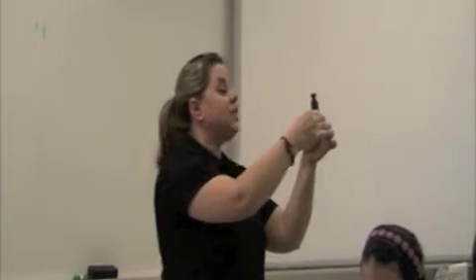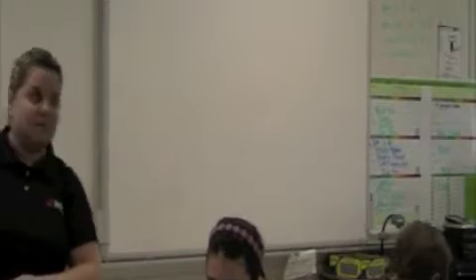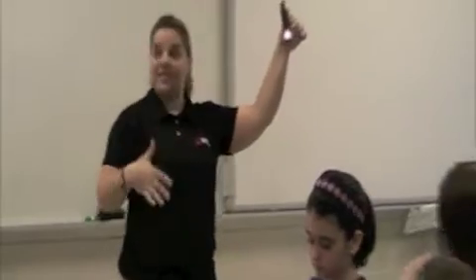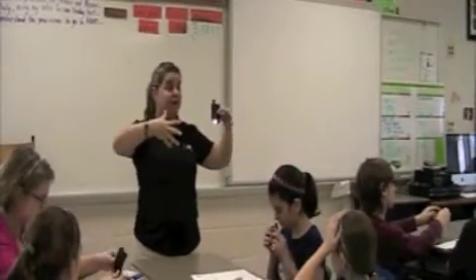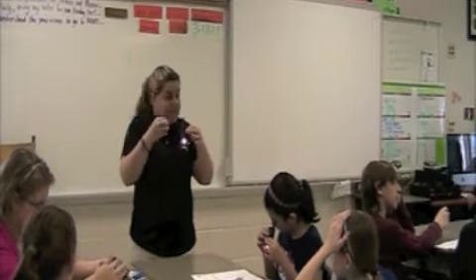Good job. Also, when I look through a lens, and you know this from the magnifying glass, which works similarly, you sometimes have to adjust where it is to get it in what? In focus, exactly. So we have a second knob that helps us adjust the lens so that we can see the object in focus. Now there's also a switch on the side. If you turn the switch on, what do you have? A light source. Remember when you learned about the big microscope, there was a light source so you could illuminate the object and see detail.